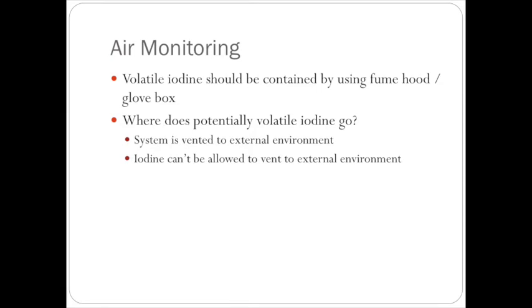Air monitoring is one of the main things that we do. When we talk about air monitoring, we are going to be checking the air that's going outside of our pharmacy, the stuff that's getting vented out. What we're constantly trying to do is make sure that the amount of radioactive iodine that's slipping through is below an incredibly small limit that has been set by the NRC. So when we say air monitoring, that's what we'll do.